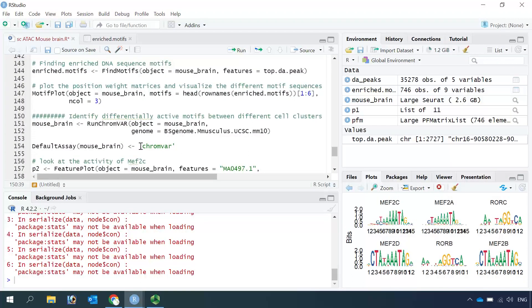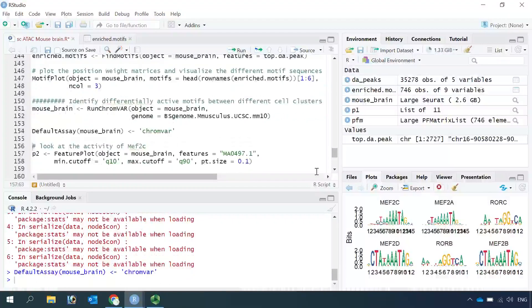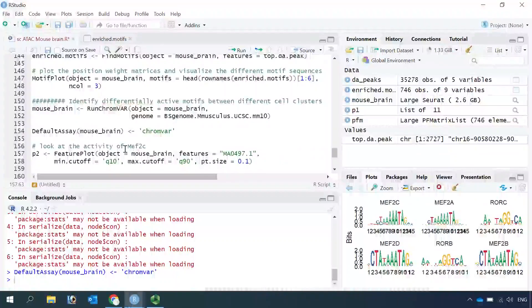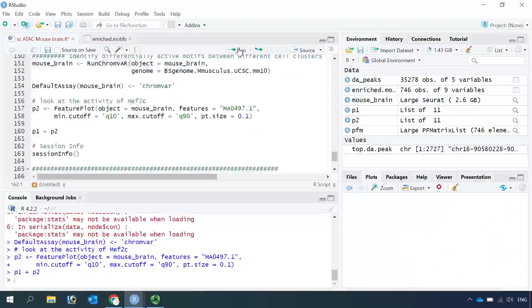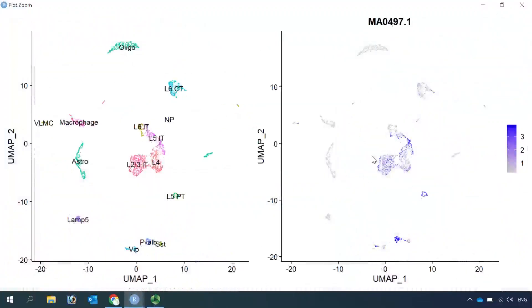So let's set the default assay as ChromVAR. Then we can use the FeaturePlot function to see the motif activities in each cell. For example, here we are going to see the MEF2C motif activity in each cell. Let's run the FeaturePlot function for the motif MEF2C. Then we can visualize the cell clusters together with the motif activity for MEF2C. We can zoom in — you can see MEF2C has high motif activity in these neuronal sub-clusters.